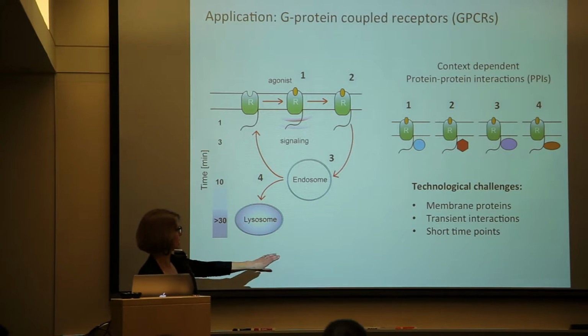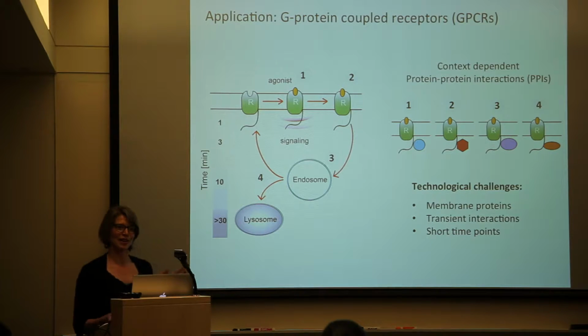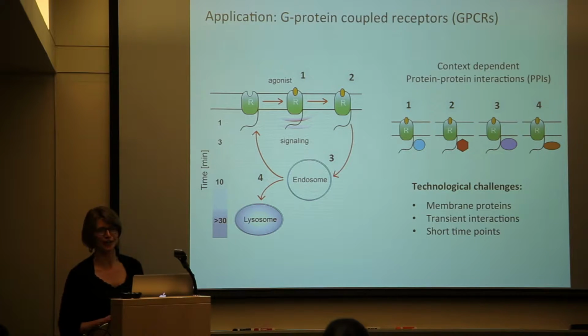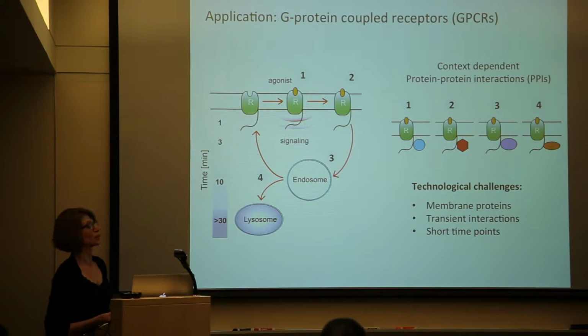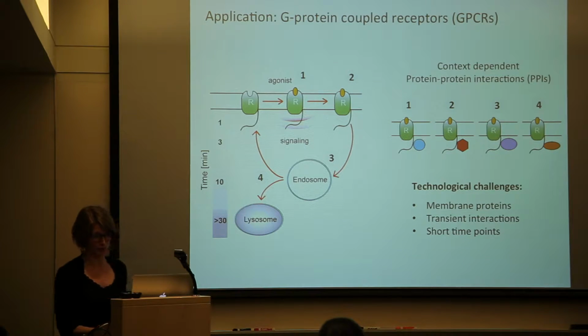And then the last challenge: if you consider these different time points where you want to figure out what the different interactors are, you have to have a high temporal resolution for your approach. This is why we wanted to overcome these challenges and develop a new approach to study these protein-protein interactions.